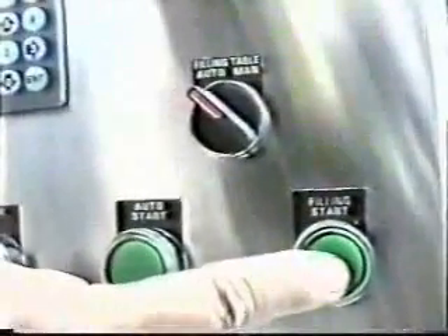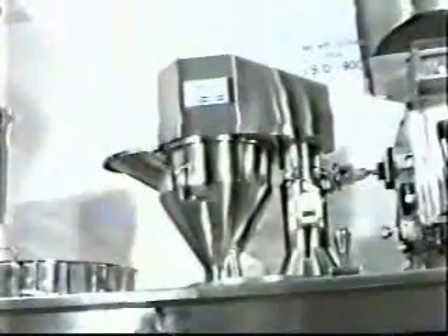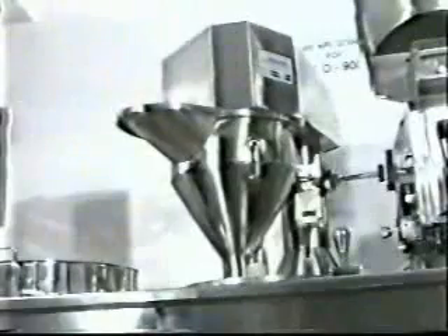In case of auto operation, keep the switch in auto mode and switch on the filling start operation by pushing the filling start push button provided on the right hand side control panel. Then swing the drug hopper over the ring for filling up powder.